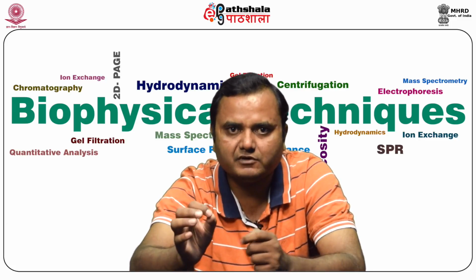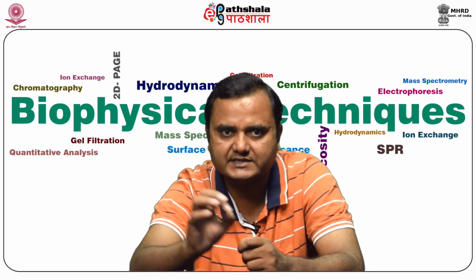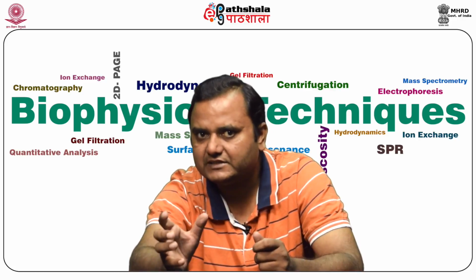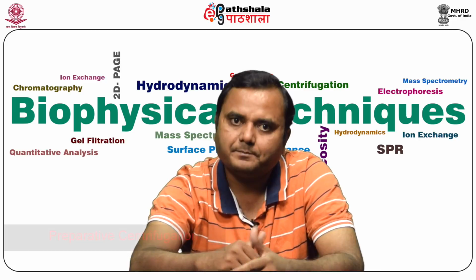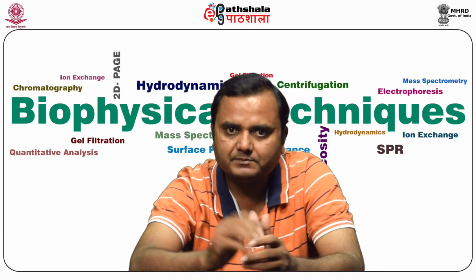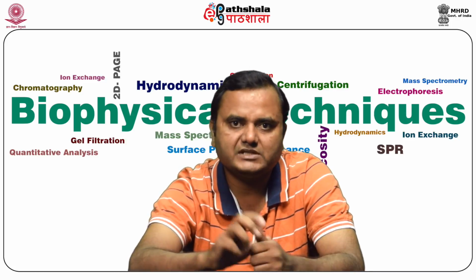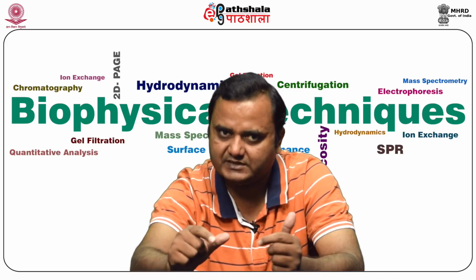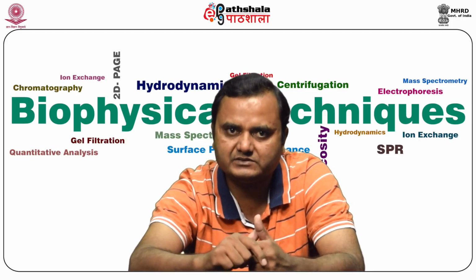Analytical centrifugation involves measuring the physical properties of the sedimenting particles, such as sedimentation coefficient, molecular mass, binding capacity and many other parameters. The other part is preparative centrifugation. The objective of preparative centrifugation is to isolate a specific particle which can further be reused. That is the main difference between analytical and preparative centrifuge.